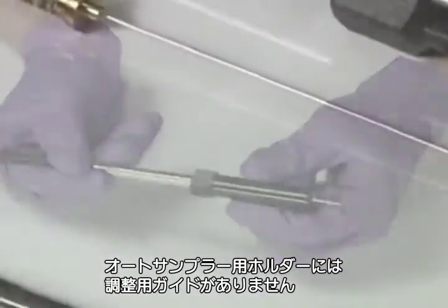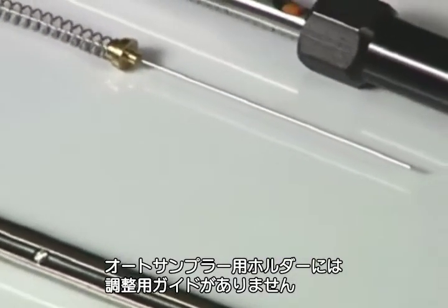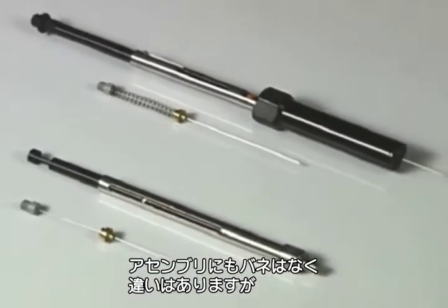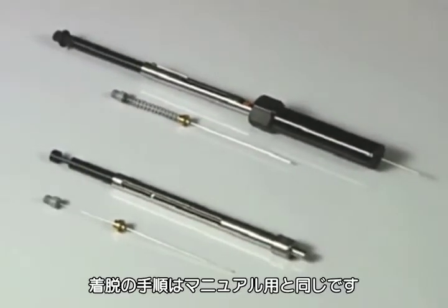The auto-sampler holder is similar to the manual holder minus the black depth guide. However, the auto-sampler fiber assemblies also do not contain a spring and are attached to the holder barrel in a similar manner to the manual holder.